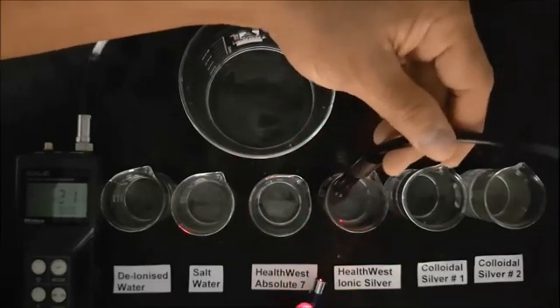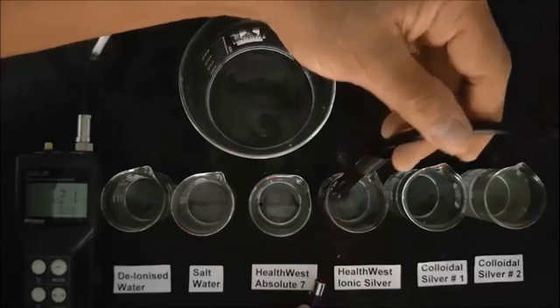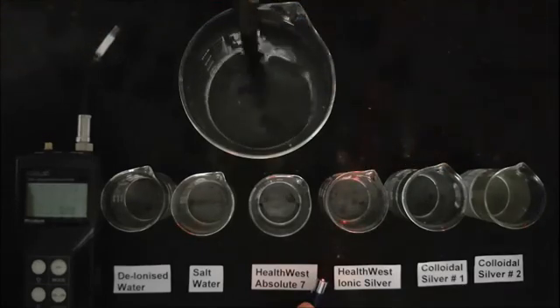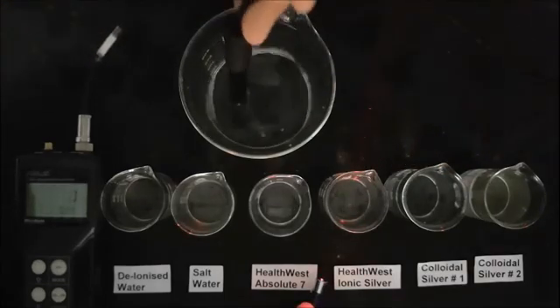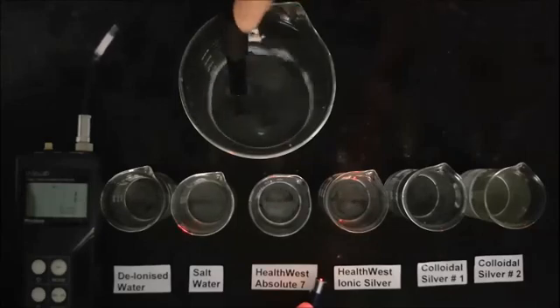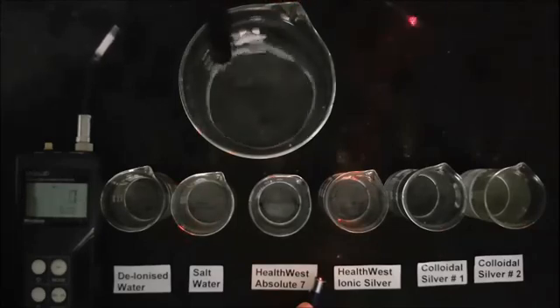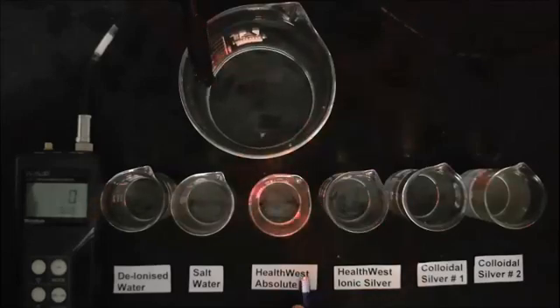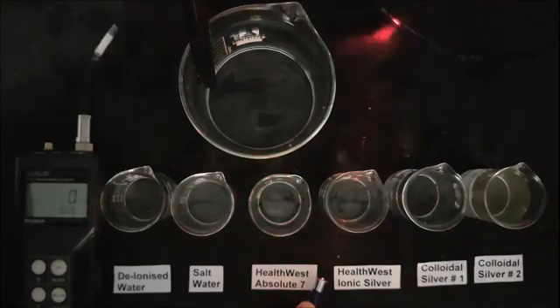The conductivity reading is 21 parts per million and this test clearly shows that Health West Ionic Silver sets a new standard in the making of silver ion solutions. Truly a class of its own and is the only manufacturer of true ionic silver in Australia.